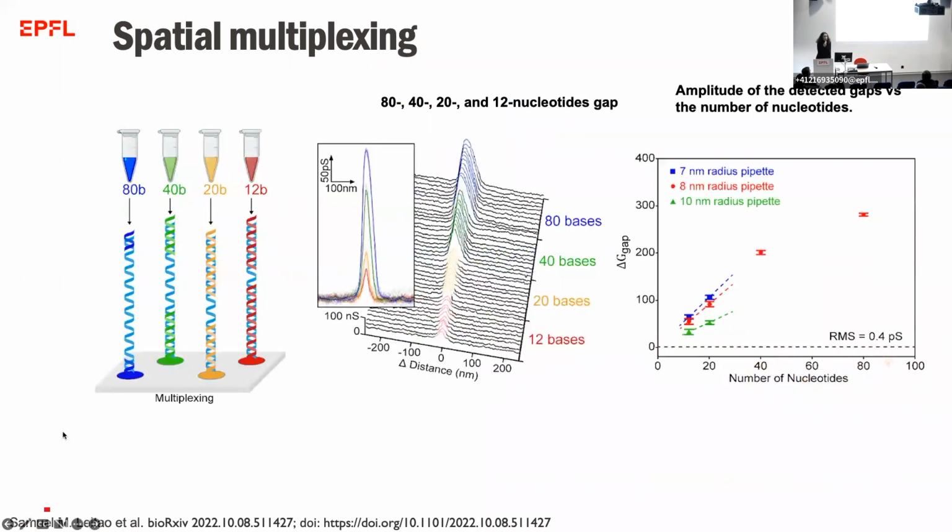Then, just to also show that the method can be multiplexed on the same sample, we spotted different sizes of gaps, and we could resolve these gaps also with our capillaries.